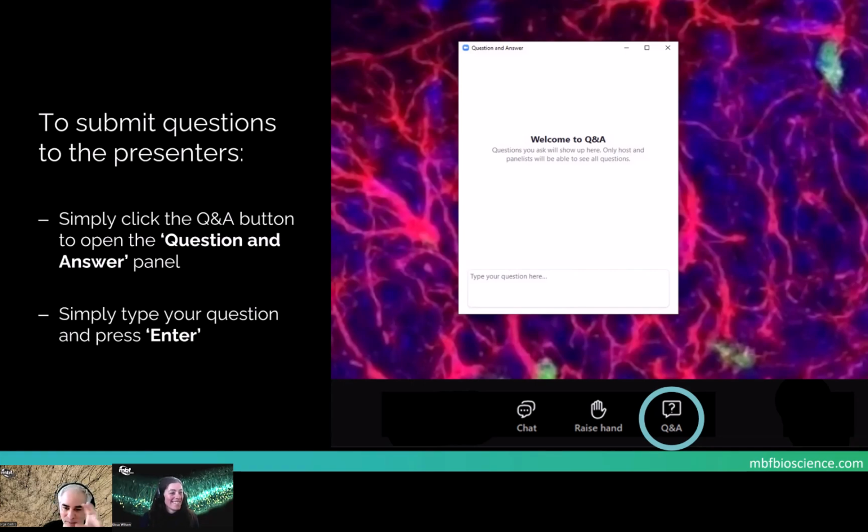Yeah, and if you remember, we got the mesh representation in some of the views. That is the software showing you some sort of size. So as Elisa has mentioned, definitely the nucleator would be the next obvious probe to implement in Stereo Investigator AI.